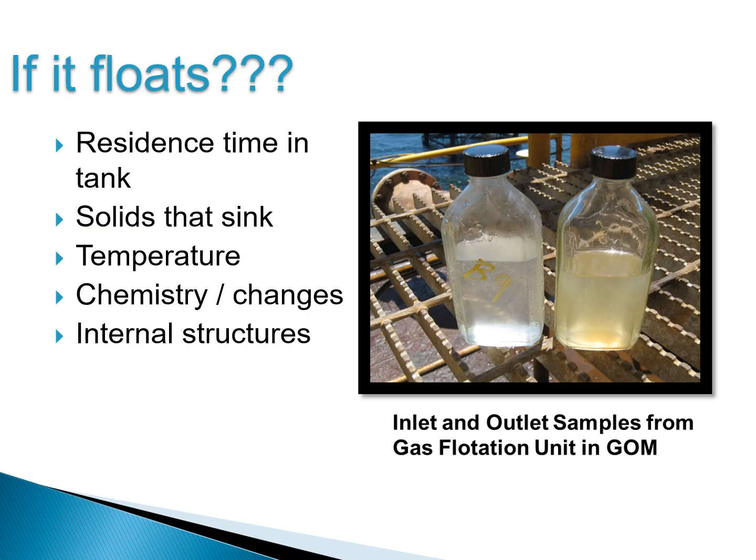The left-hand picture, that is after a gas flotation system. So gas bubbles are induced into the water phase. Those gas bubbles will force oil to the top, and then the oil can be skimmed off. So it's cleaner, more oil has been removed, and now we have a relatively low oil content water. But you can still see that's not pure clear water. There's still something left in there. This is also very stable. There's no interface, there's no sheen, there's no oil surface at the top.